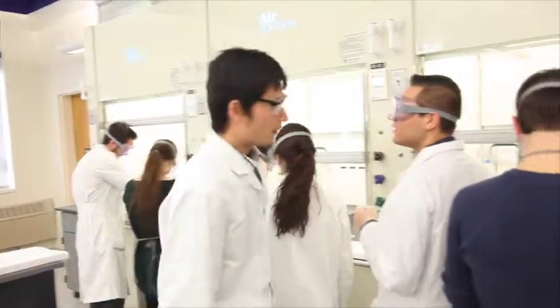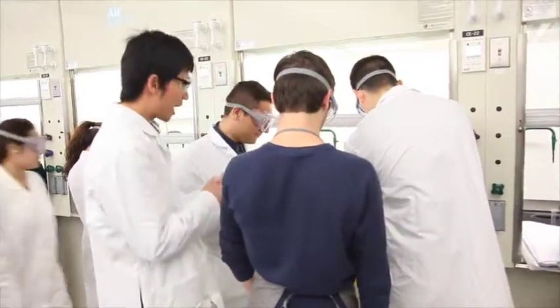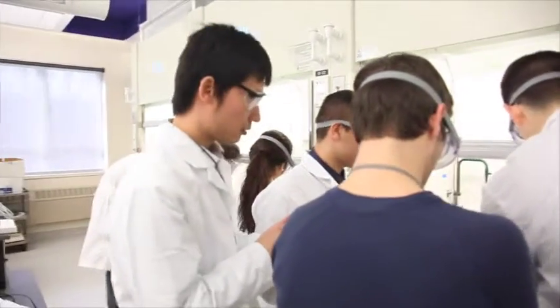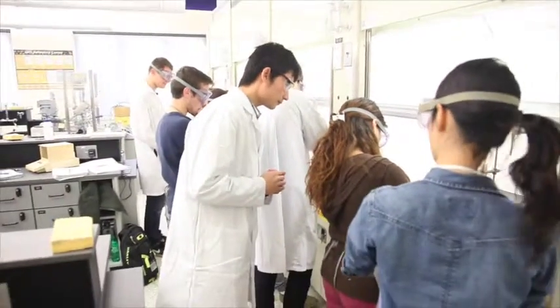You broke it? Nothing to do here? A little bit. Okay. So you have the acid and ether inside? Yes, everything's there. And the acid? It was acid and then the... That's good. Everything good? Yeah, we just did ice, acid, and diethyl ether. Now we're just scraping it.